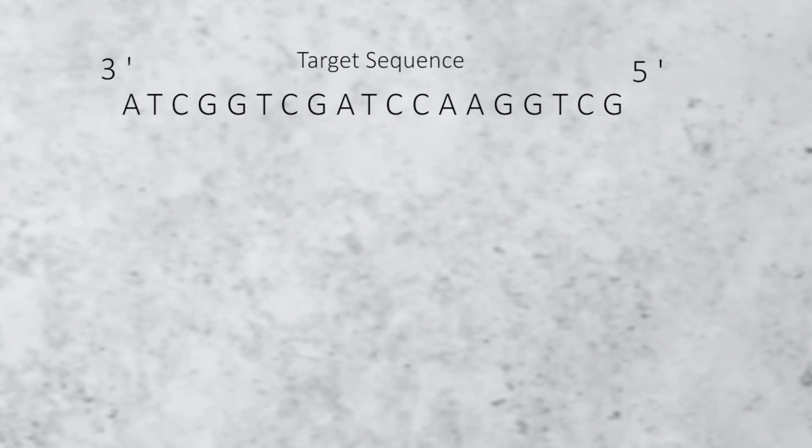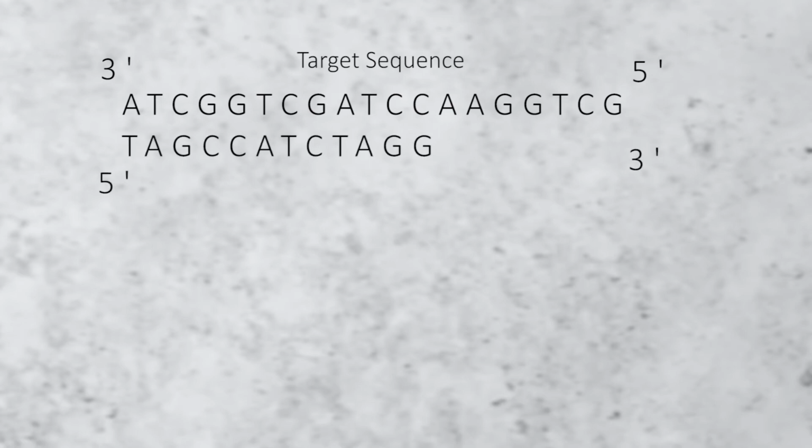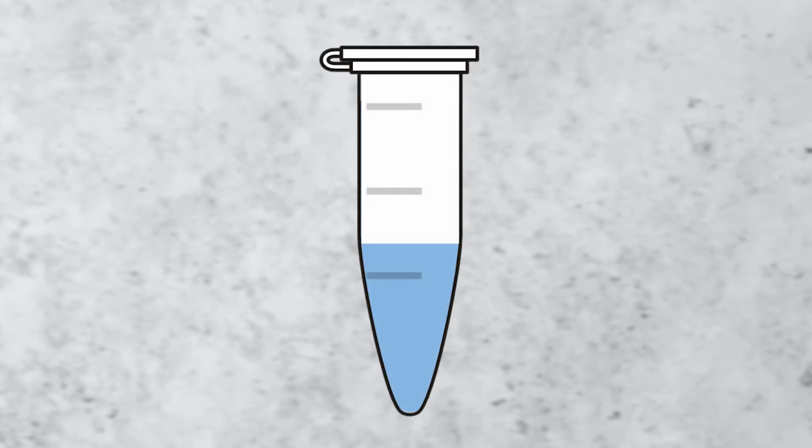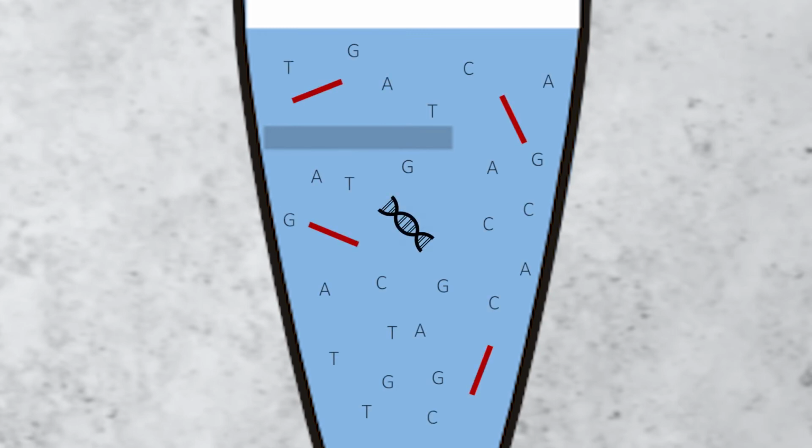The first step of this process is to create fragments of different sizes of the target DNA. This is performed using a PCR process. However, the PCR reaction is not conventional. The first major difference is by only using 1 target-specific primer, either forward or reverse. The sequencing reaction PCR is prepared, which contains buffer, the forward or reverse primer, target DNA, and individual nucleotides. These nucleotides consist of a ratio between normal dNTPs and fluorescently labeled ddNTPs.